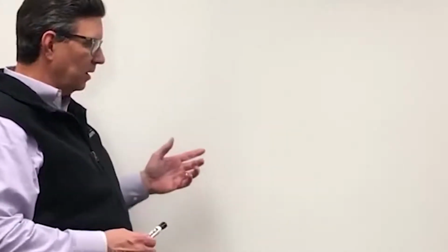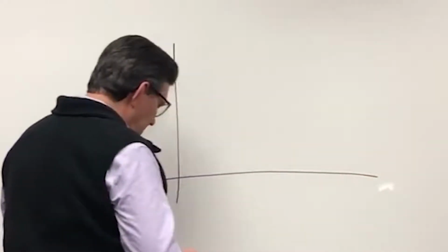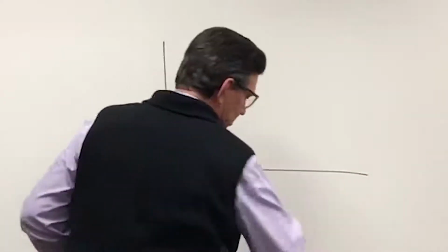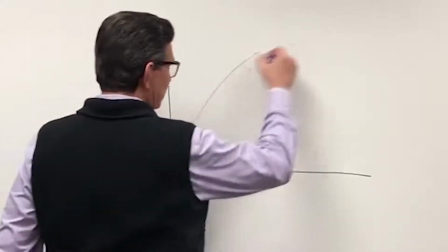Right, so when I was first introduced to the QualiTru system a number of years ago, I saw this idea of using a pump in a bag to develop a sample of what's in your process line is pretty unique, and I kind of liked it. But really, there's a math reason behind this. I like using whiteboards. I like graphing stuff because I'm an engineer, and pictures do well with us.